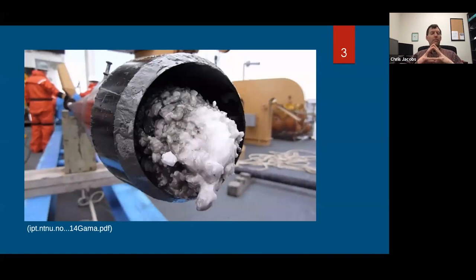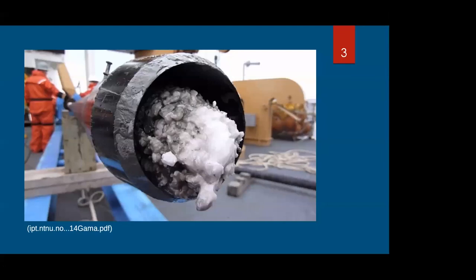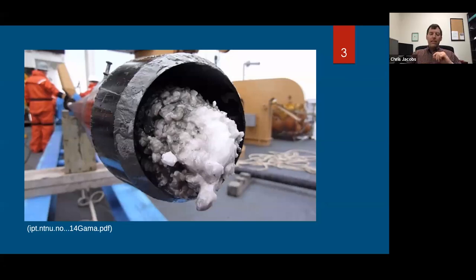I'm not sure I understand the question about what a hydrate model is. So for the next question, what is the main role of the reference detector in chromatography? What's the main role of the reference detector in the chromatograph?